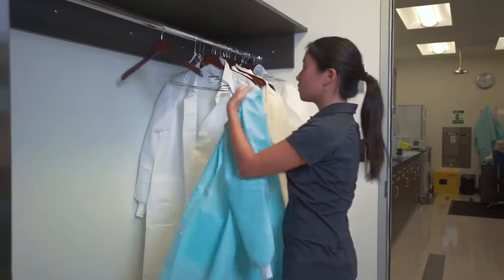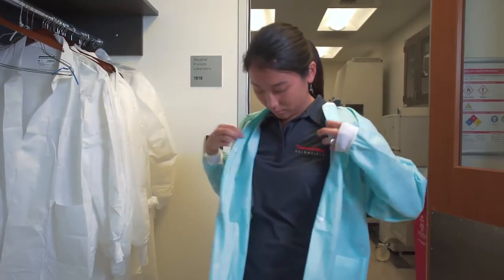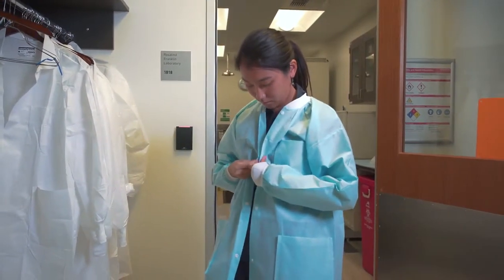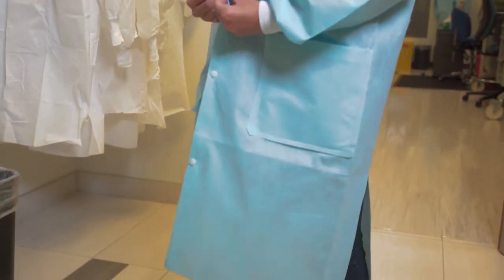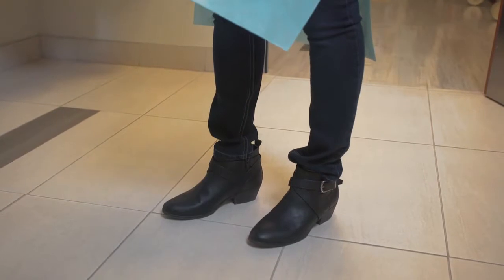Always wear basic personal protective equipment, or PPE, when working in the laboratory. Talk to the safety team at your institute for your required PPE. Also, remember to review the MSDS information before working with any media or reagents. Wear closed-toed shoes and clothes that cover your legs.